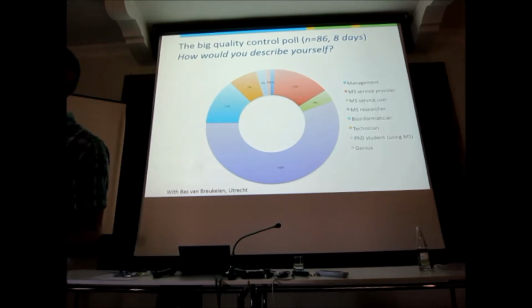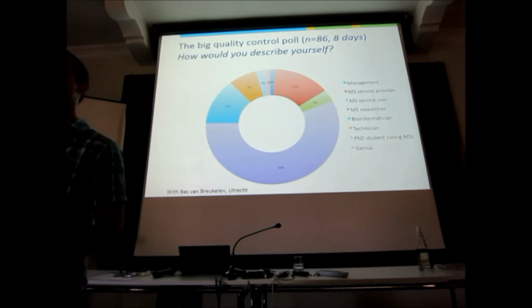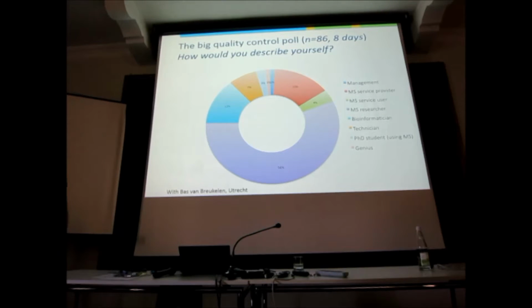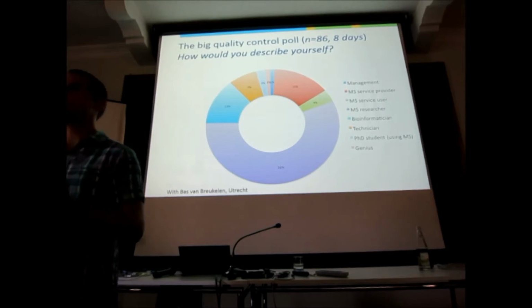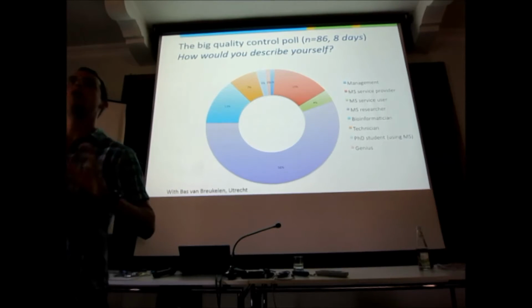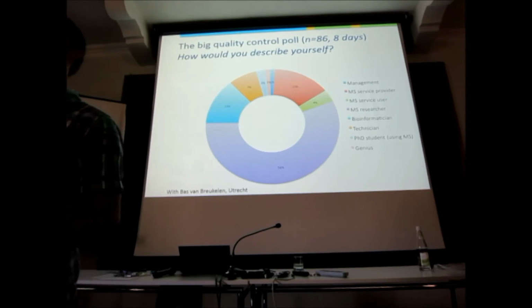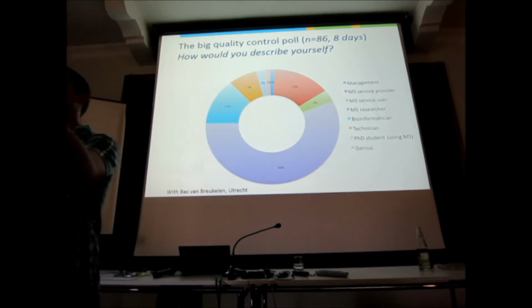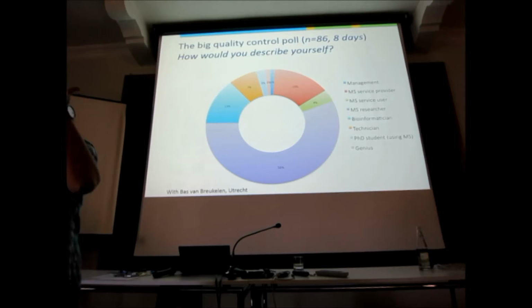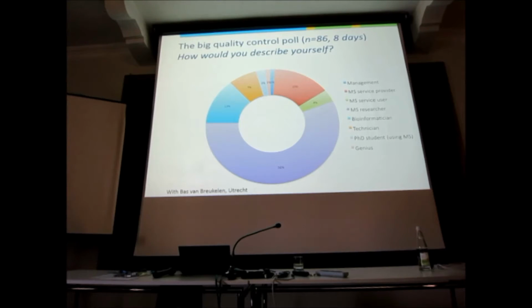our sibling field, they have something called accreditation. If you want to be an analytical chemical lab with an official accreditation that you're allowed to do this kind of stuff, you know what they do? They send you test samples on the stuff you're accredited for. This is made by the standardization organizations, and you know nothing, only that you're supposed to measure a particular compound or set of compounds in this mystery sample. And they ask you for the amount and the error on the measurement. And the error must be less than what they dictate is the norm for accreditation.